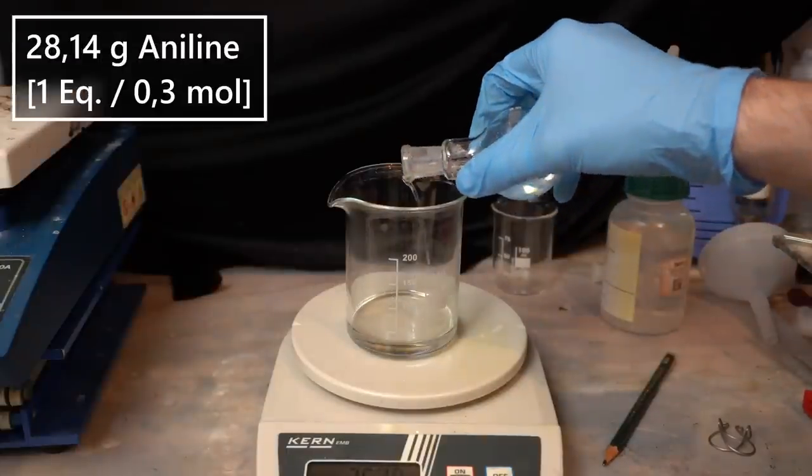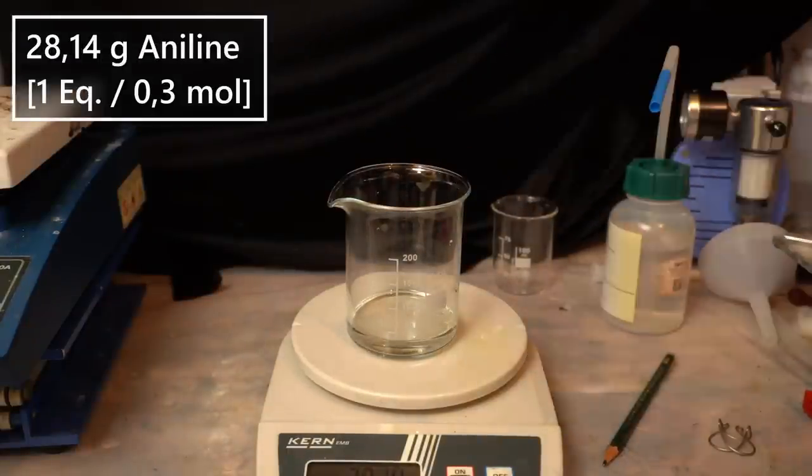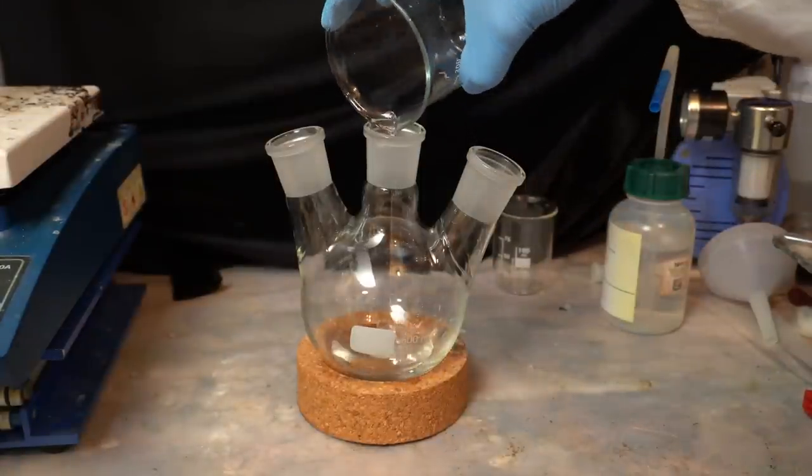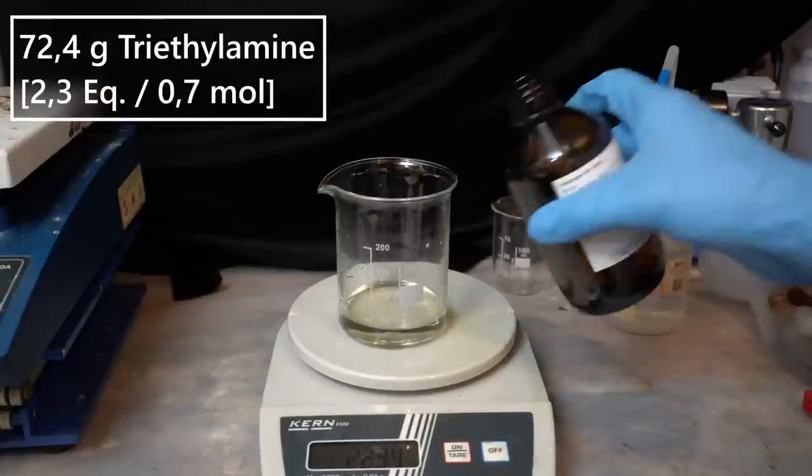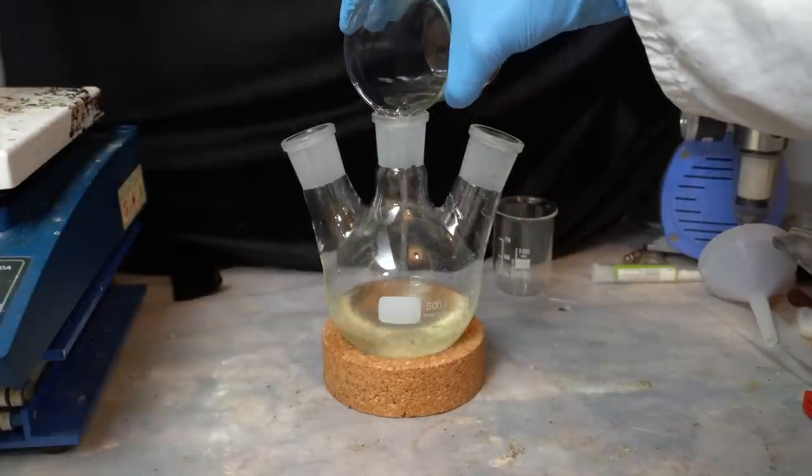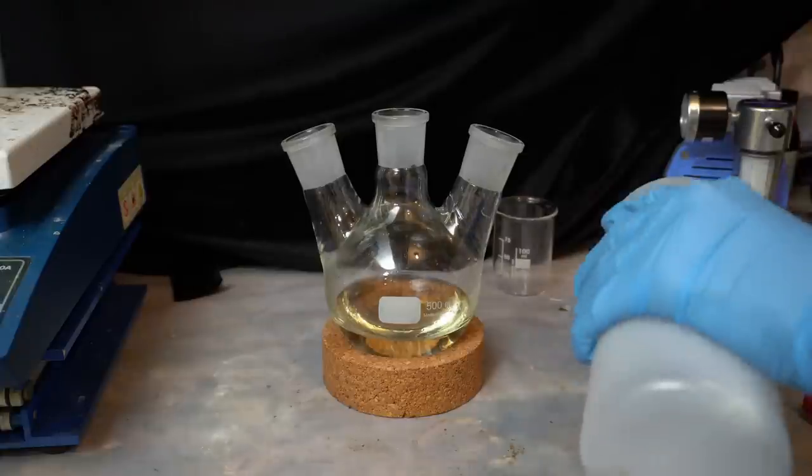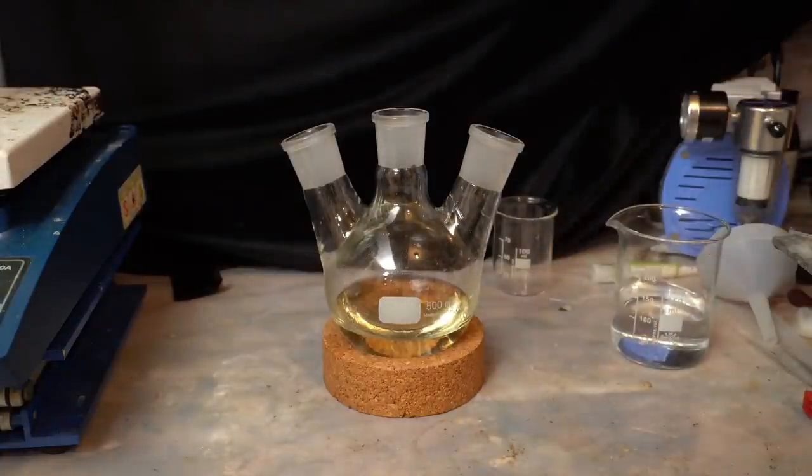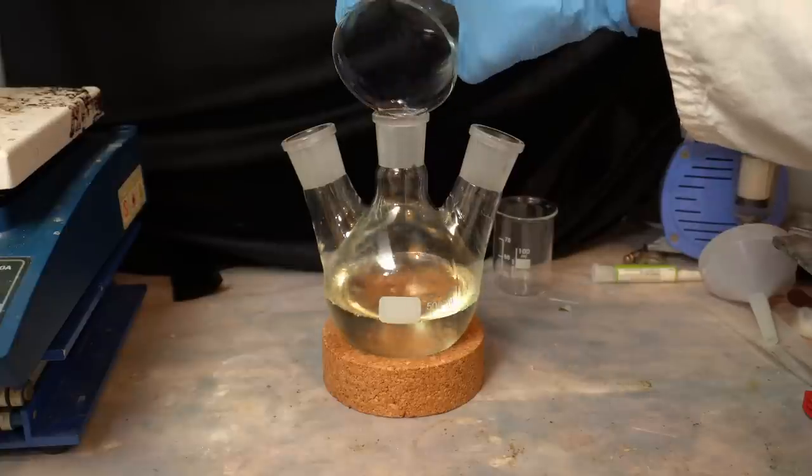28 grams of the fresh aniline are now weighed out and transferred to a 500 milliliter round bottom flask. Additionally 72 grams of triethylamine are also added to the flask. The beaker is then rinsed with 80 milliliters of acetone which will serve as the solvent for this reaction.